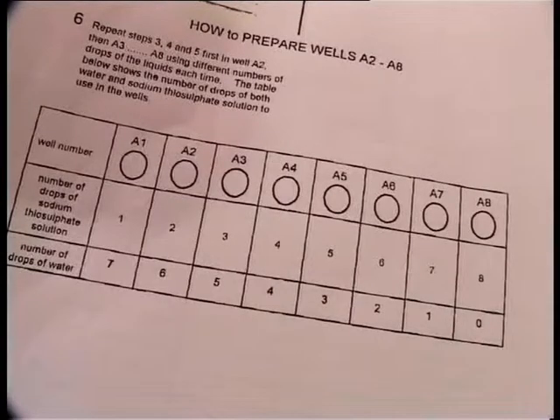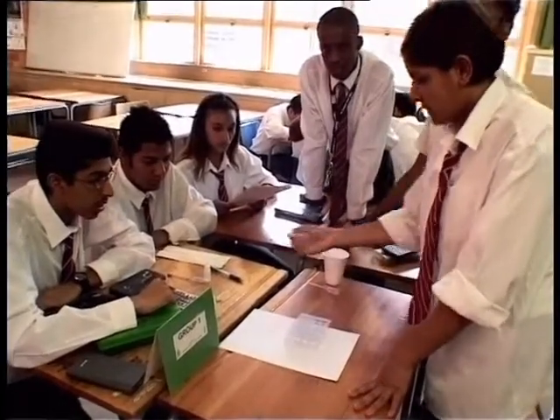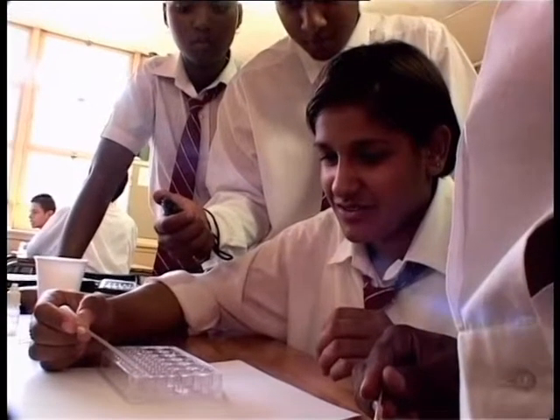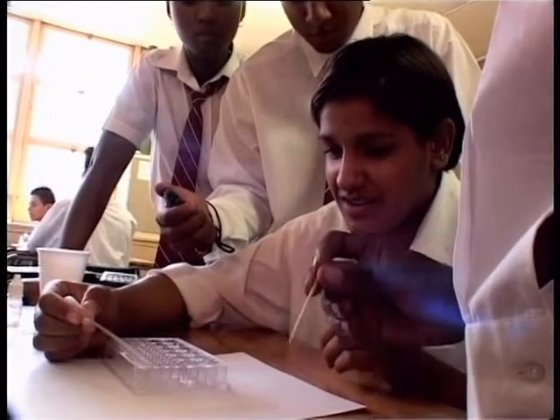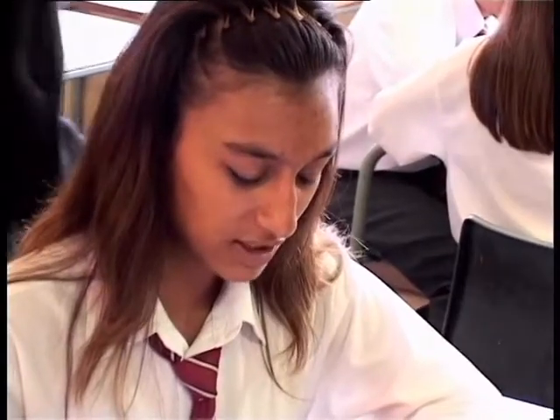The attached table shows the proportions of sodium thiosulfate to water in each of the wells. Notice that in each consecutive well, 1 additional drop of sodium thiosulfate is added and 1 less drop of water. When the wells are prepared, the learners start and time the reaction. Use the appropriate label HCl to add, as quickly as you can, 5 drops of hydrochloric acid to well A. Stir quickly with a clean toothpick and start the stopwatch.